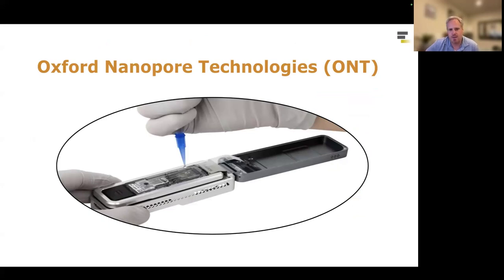Ultra long meaning that we're going to be specifically targeting reads that are 100,000 base pairs or longer. So whereas HiFi reads tend to max out at about 15 kb, here we're specifically targeting reads that are 100,000 base pairs or longer. So you get the equivalent of, I don't know, 8 or so HiFi reads assembled back to back to back in a single Nanopore read coming out.